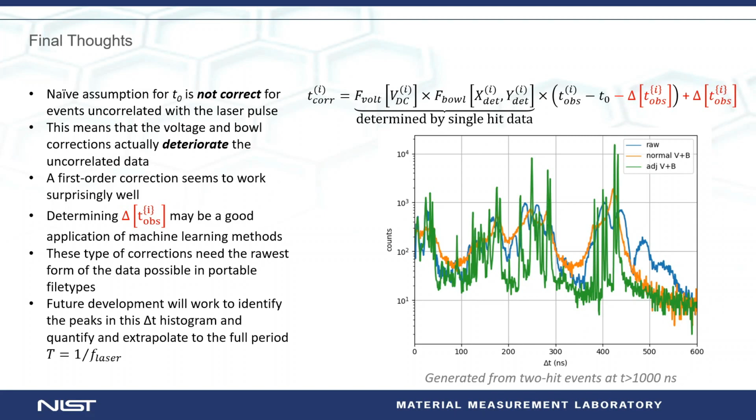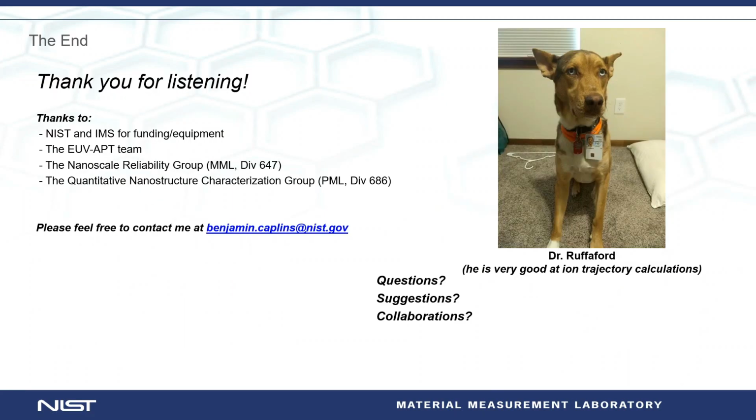And future work will go into identifying the peaks in this delta T histogram and trying to quantify and extrapolate those to the full time between laser pulses to see how that may affect composition. So thank you for listening.